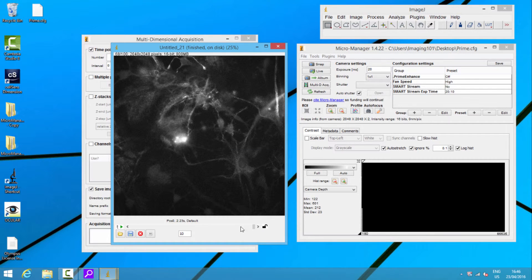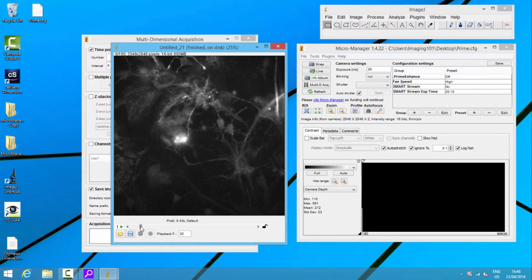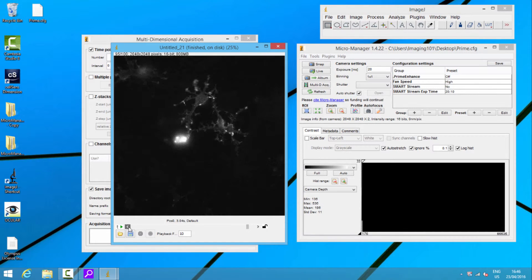Let's acquire 100 images — 100 images at 20 milliseconds. When I play through it, you can see it going red, green, red, green. By the end of it, it takes about three seconds — starting at about 0.2 — so three seconds total. That means I'm running at about 33 frames a second, alternating red and green. Really fast, don't have to think about it.